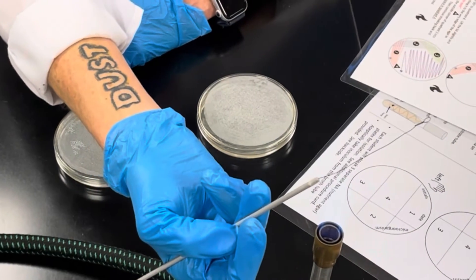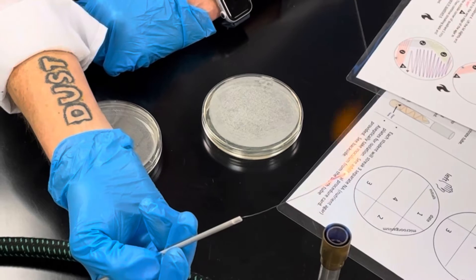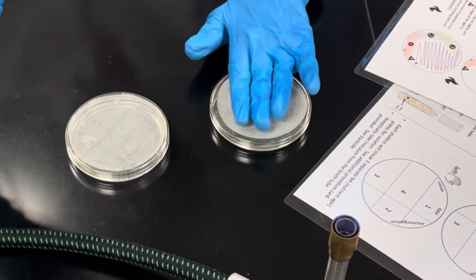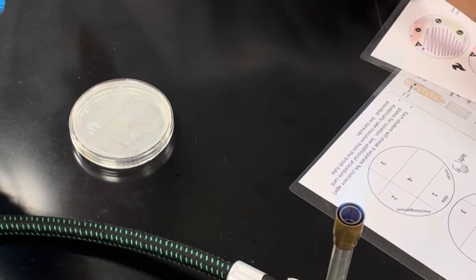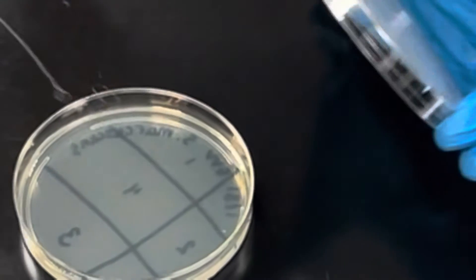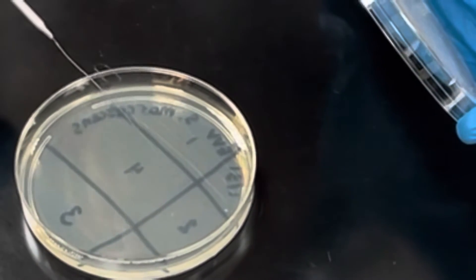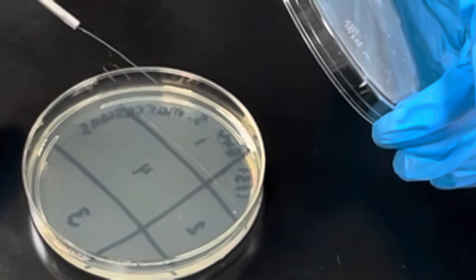Flame from the base to the tip until it glows orange. We're not going to go back into the original plate. Flip it back over, then rotate our new plate counterclockwise so that number two is now at the top.